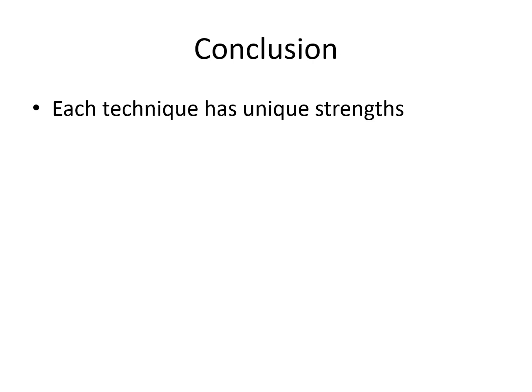HPLC can be used to detect and quantify compounds in an analyte, and is more rapid and more automated compared to thin layer chromatography, and hence it is more reliable and has higher speed, although it is more expensive.